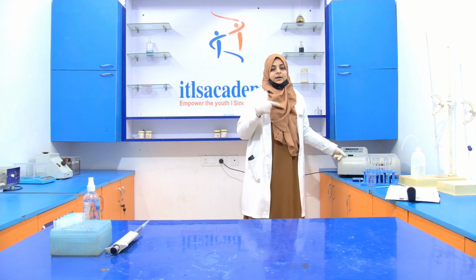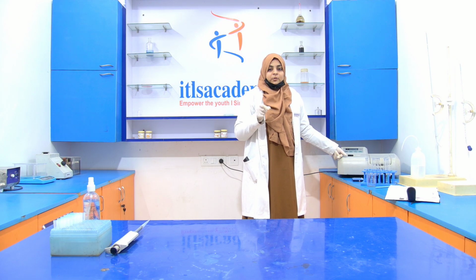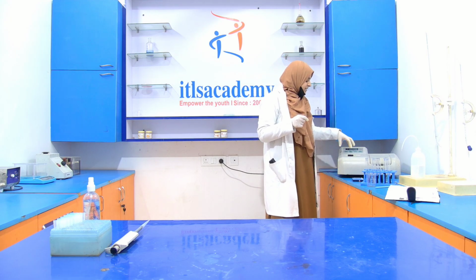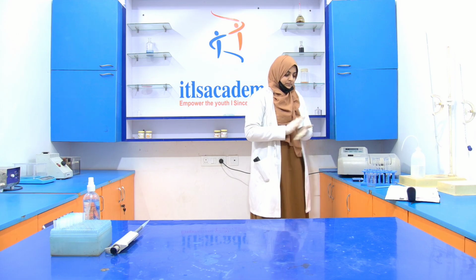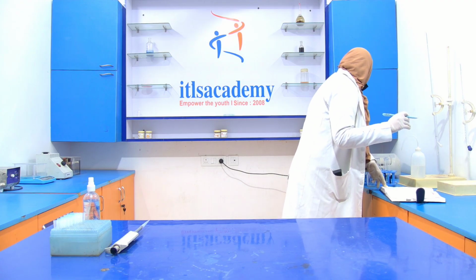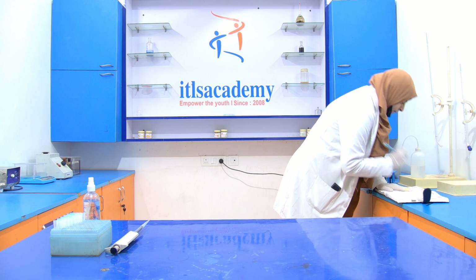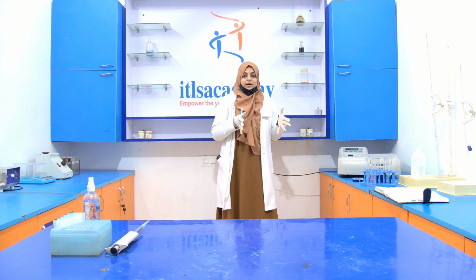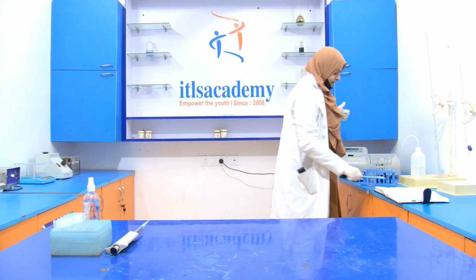One more thing, the wavelength of this experiment will be around 660 nanometer. So I am taking the absorbance at 660 nanometer and I just set that reading with the help of this black knob. So here I get the reading around 0.028. When the concentration of the BSA is 0.2 ml, then we get the absorbance 0.028.